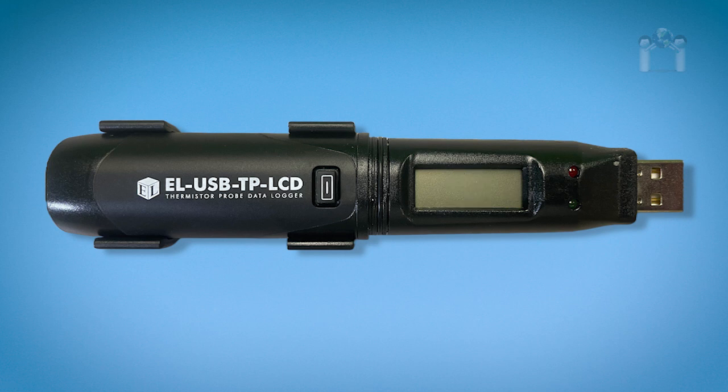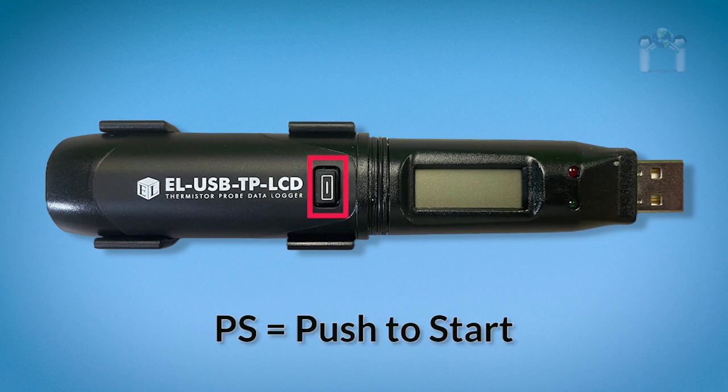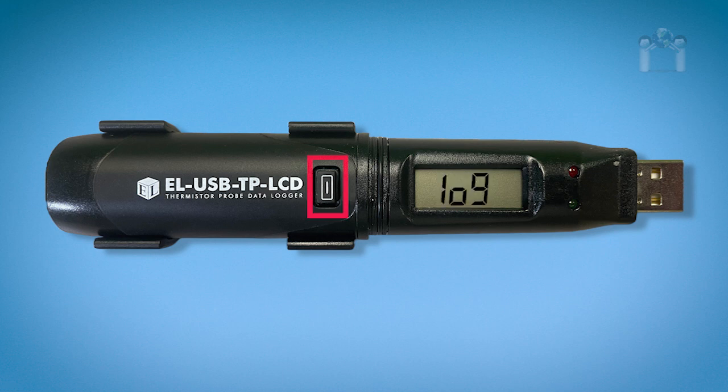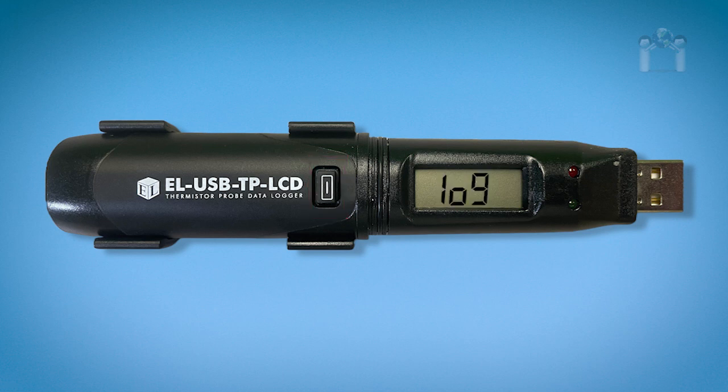When the data logger is primed but configured not to start until the button is pushed, PS, push to start, will continuously flash on the display. After pushing the button, the word log will start to flash on the display to inform you that the logger has started recording.